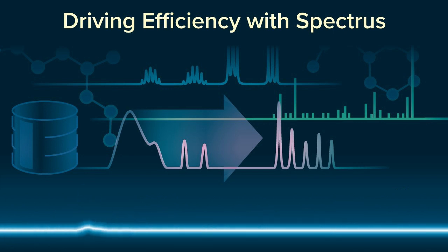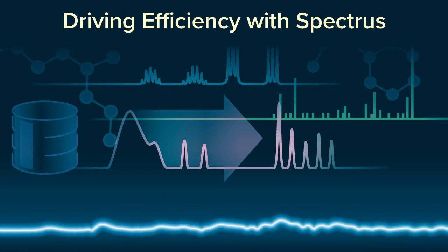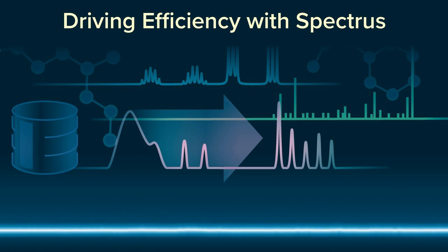Everyone likes easy wins. What are some of Matt's suggestions? So these are some of the key easy wins that we can achieve as analytical sciences when we're trying to deliver our method development strategies. So this is about driving the work that we do and getting to the right first time mentality so that we're not wastefully repeating experiments that have failed for reasons that could otherwise have been preventable.